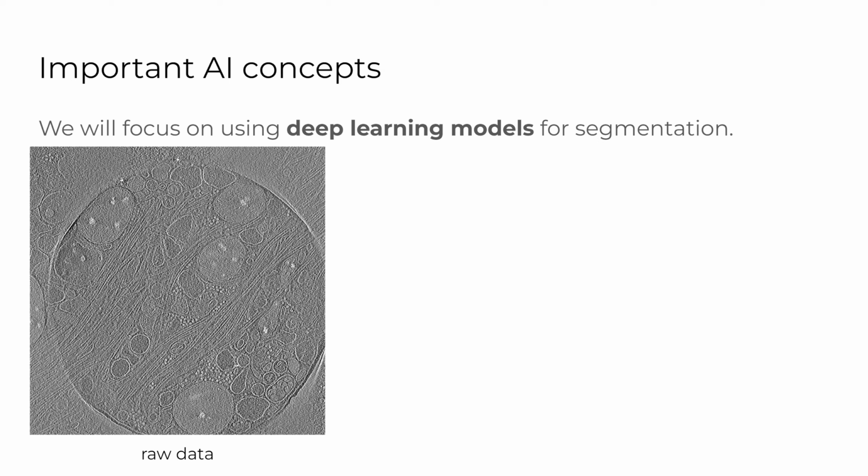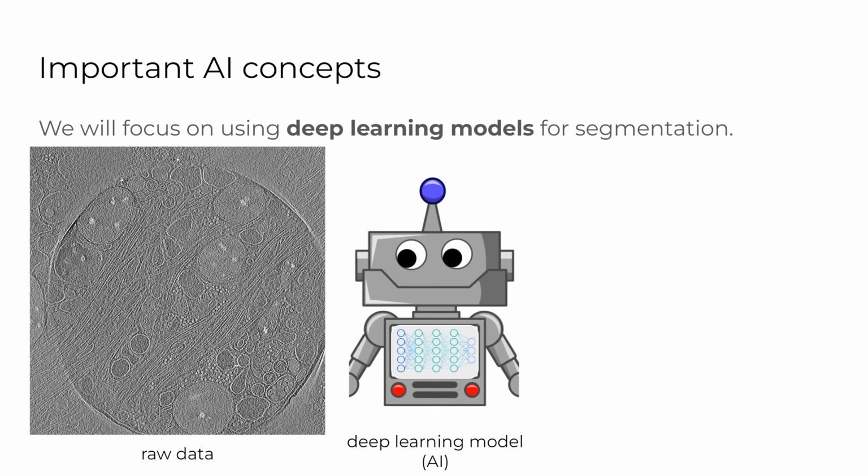For us humans, it's kind of easy to recognize. And for example, the tubular structures are also visually clear to see. For things like this, it's very helpful to use deep learning models to learn those and segment those automatically.